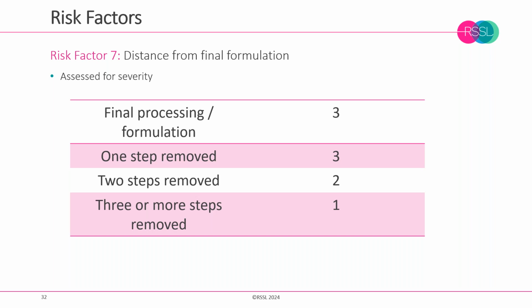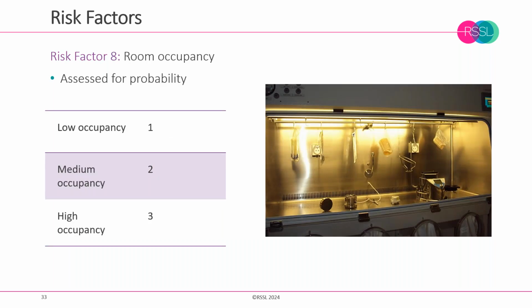And when we move upstream, we're going to have more microbiological reduction steps. So we may have points where we're adding antimicrobial materials, we might be using filtration, we'd be using different processes that could dilute or contain contamination better, and our chances of doing something become fewer and fewer as we get towards the very end of the process.